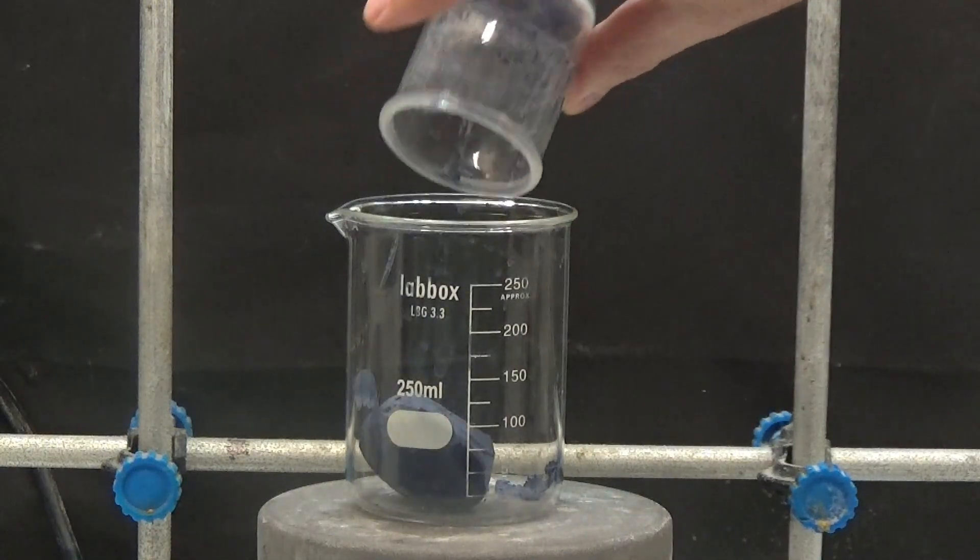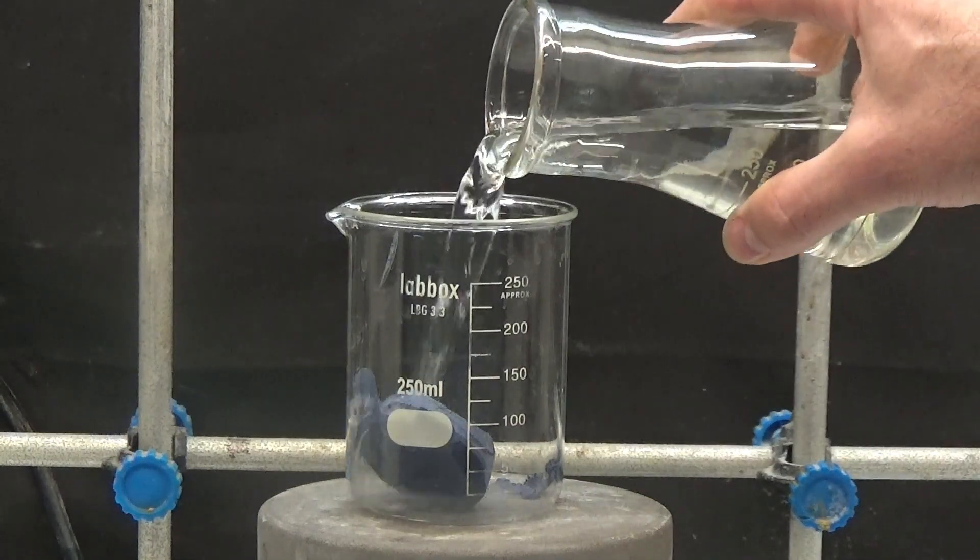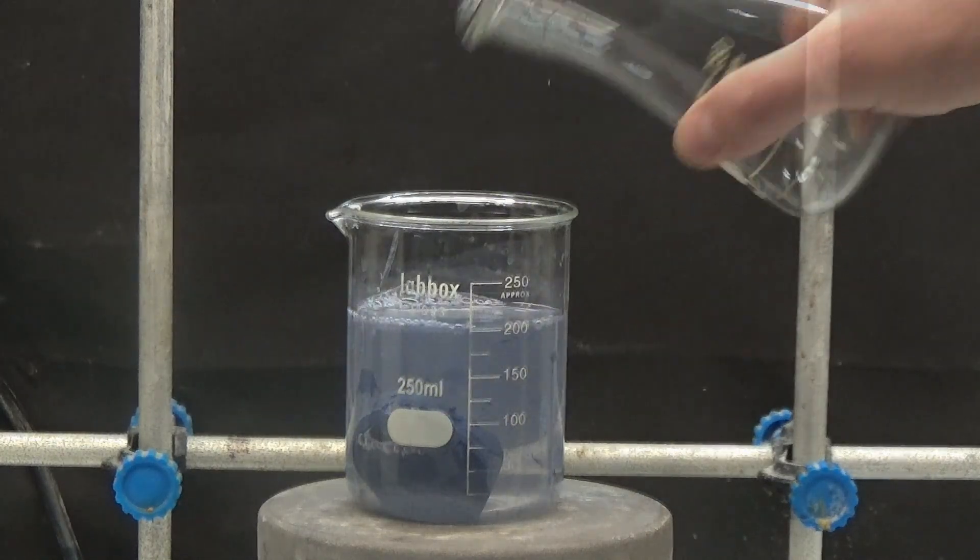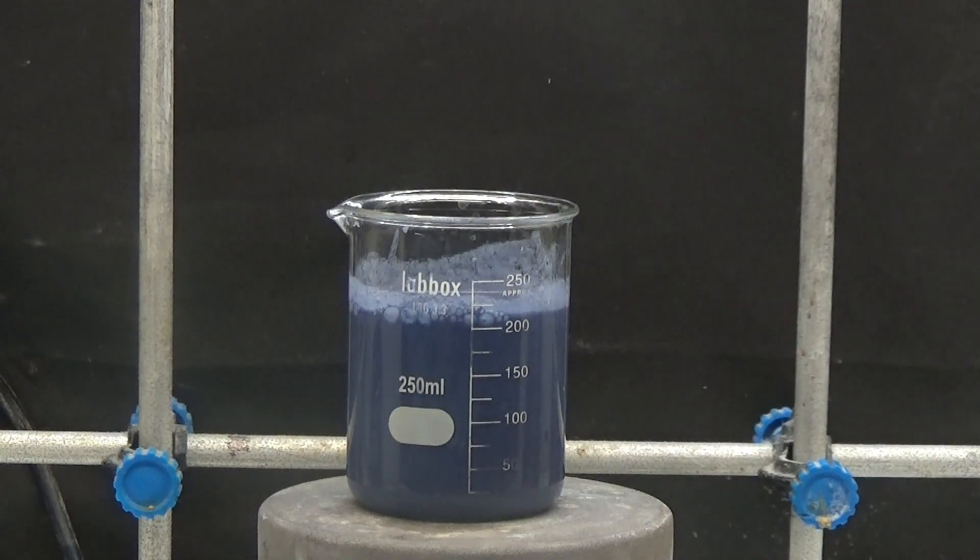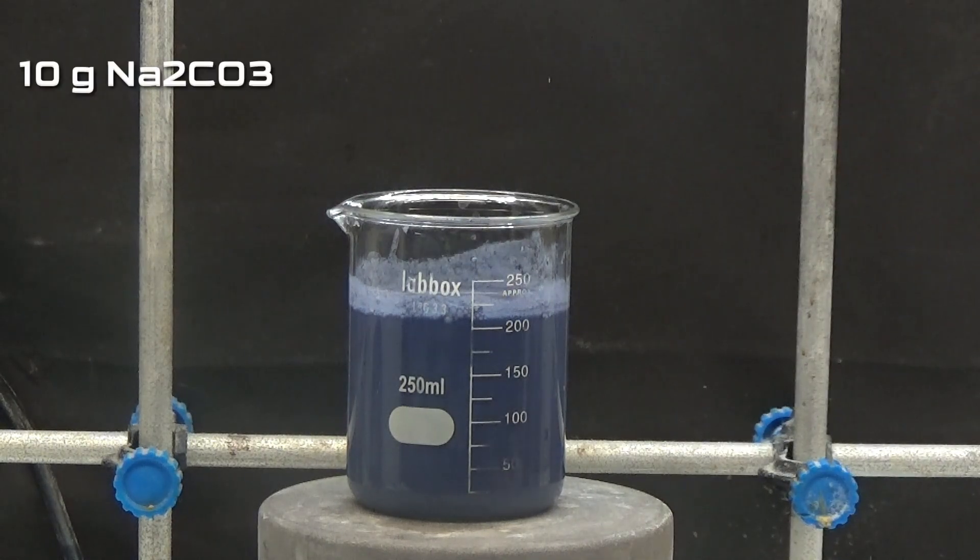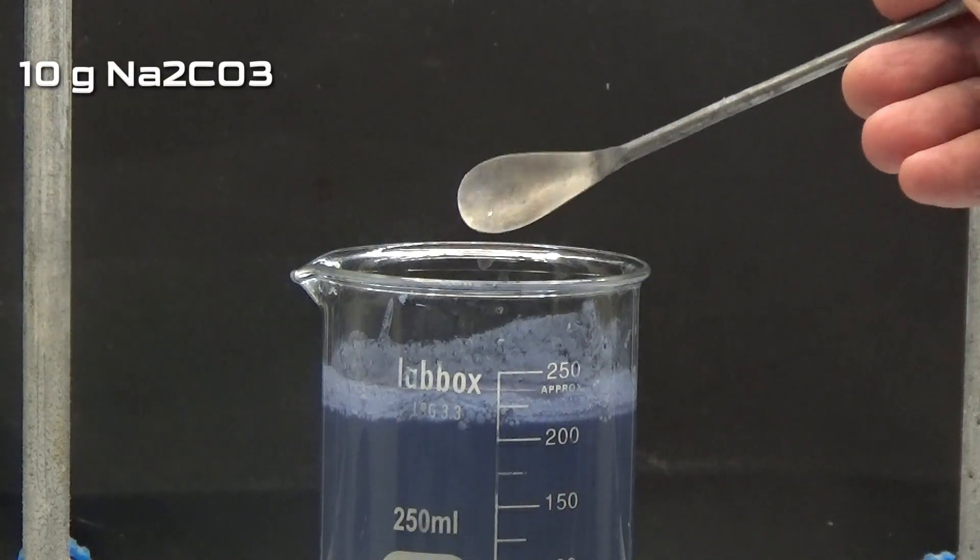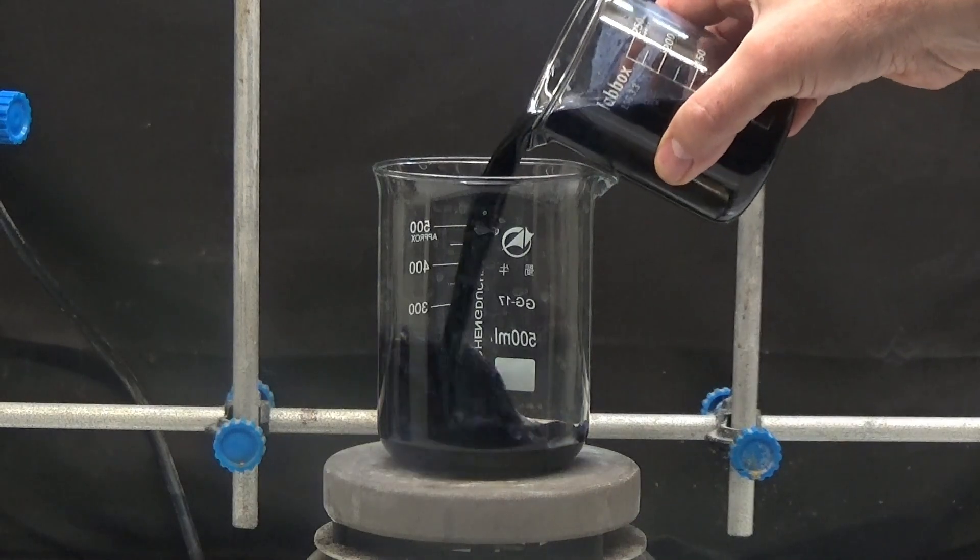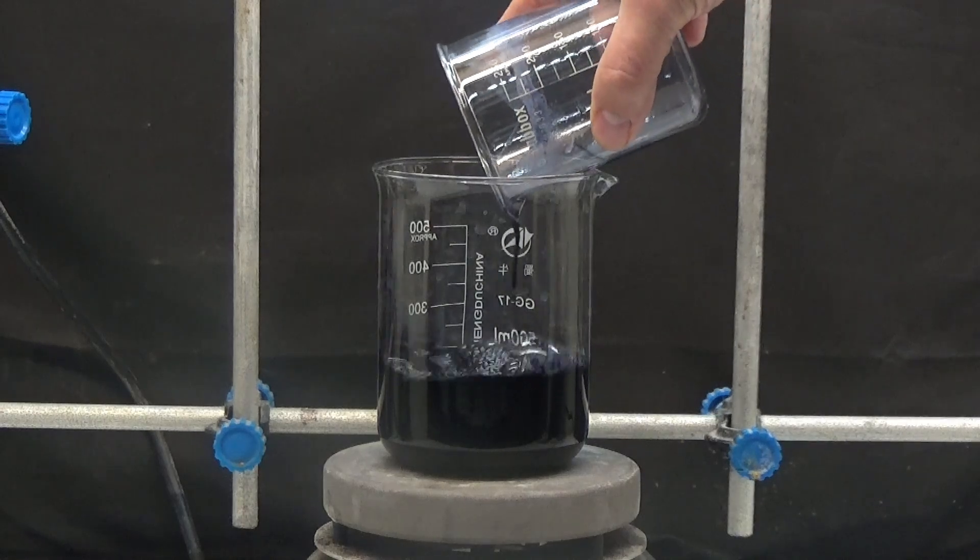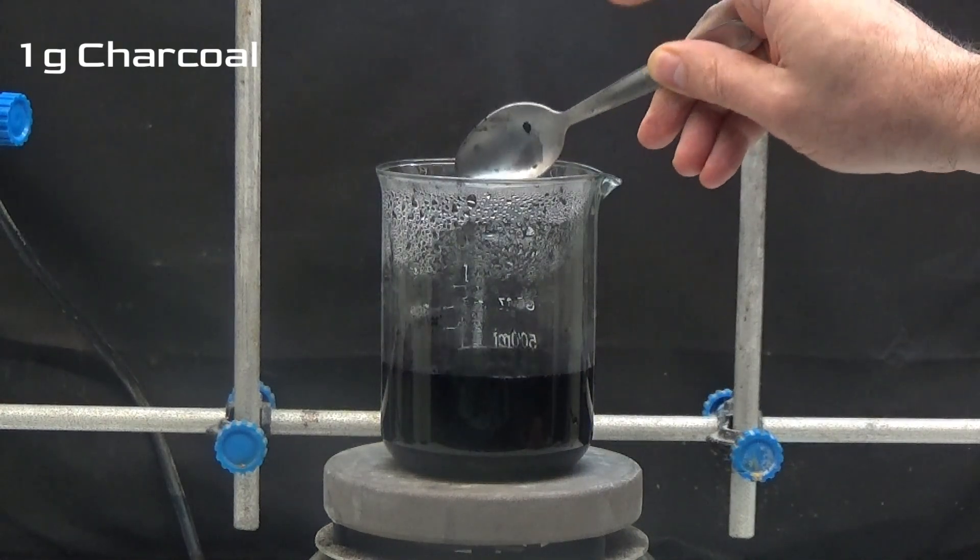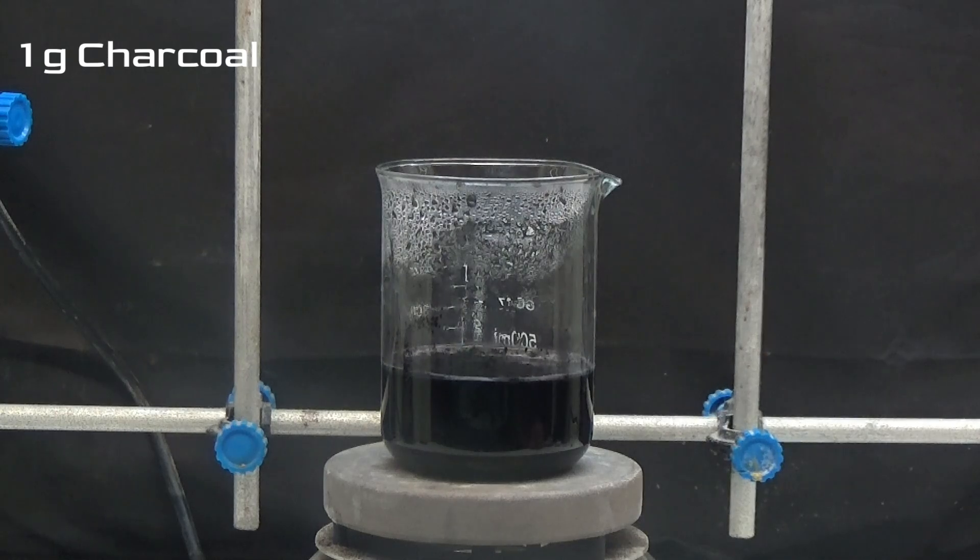The wet cake from the funnel is put in a 250 milliliters beaker and water is added up to a volume of 200 milliliters. We heat with agitation and slowly add 10 grams of anhydrous sodium carbonate during a time of 5 minutes. Once dissolved, the precipitate is put in a glass of 500 milliliters and we add 1 gram of charcoal. We boil for 10 minutes.